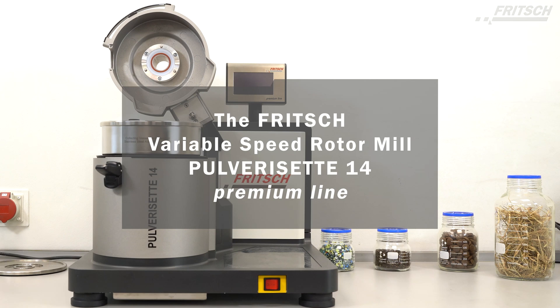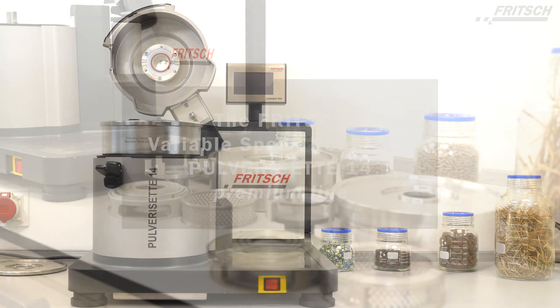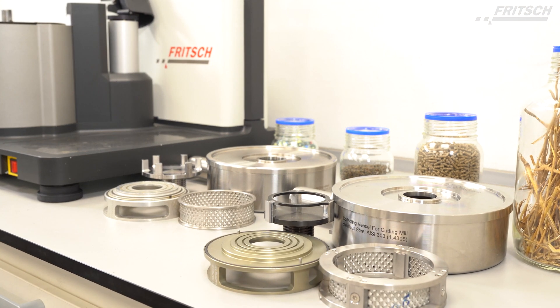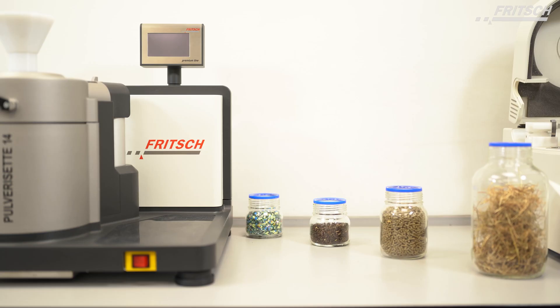The Fritsch Variable Speed Rotor Mill Pulverisette 14 Premium line — for each application, the perfect solution. It offers impact, shearing, and cutting comminution in one instrument.